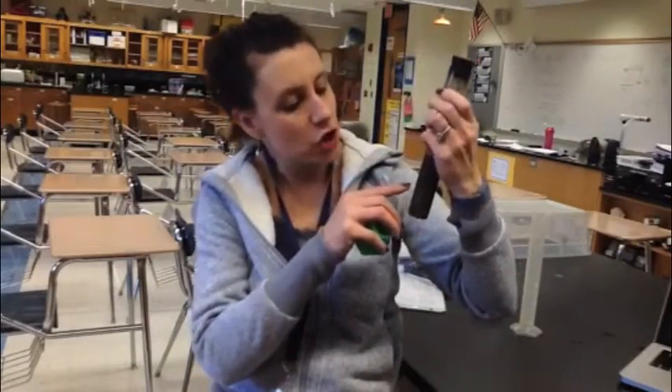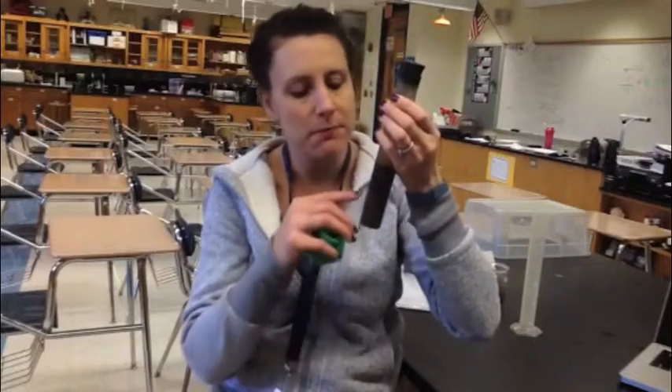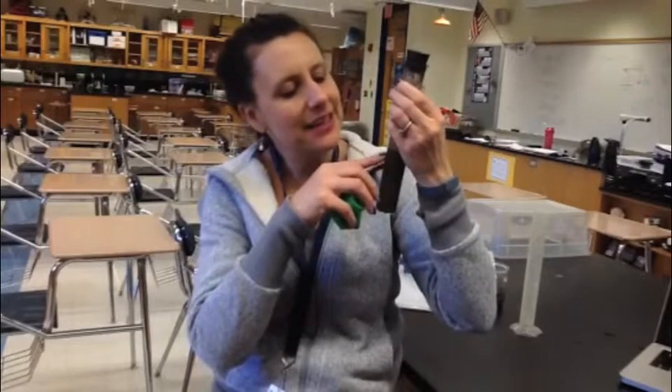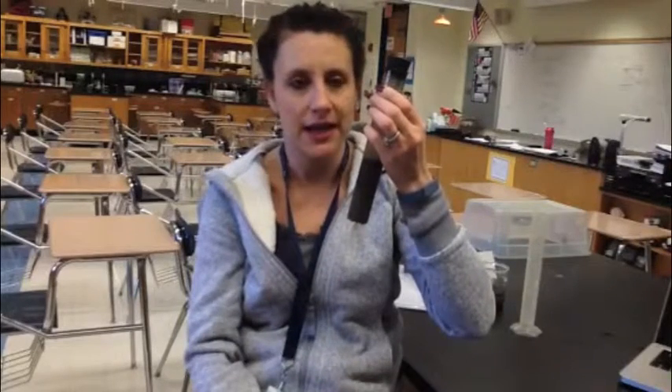The next layer is a dark layer right above the sand, and that layer is silt. You can measure out that layer and put that into the chart — that's going to be your silt layer. On top of the silt is a slightly lighter layer that is called clay. You can measure out that layer — that's your clay number.